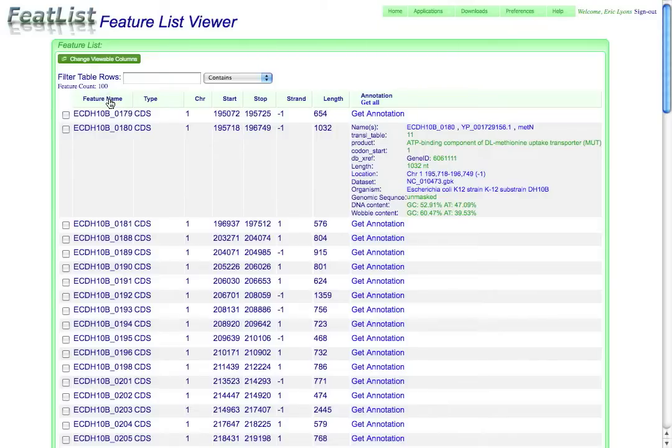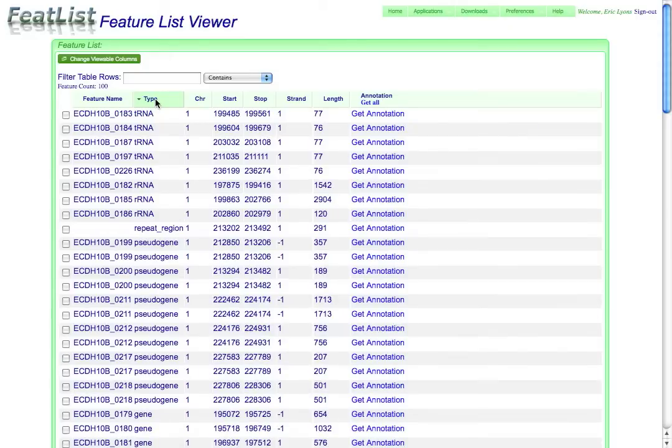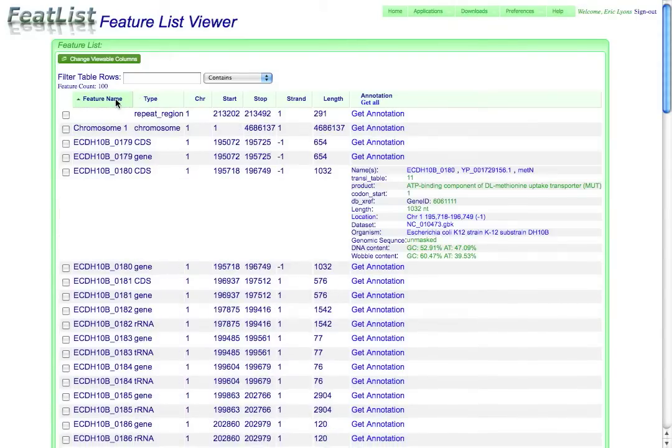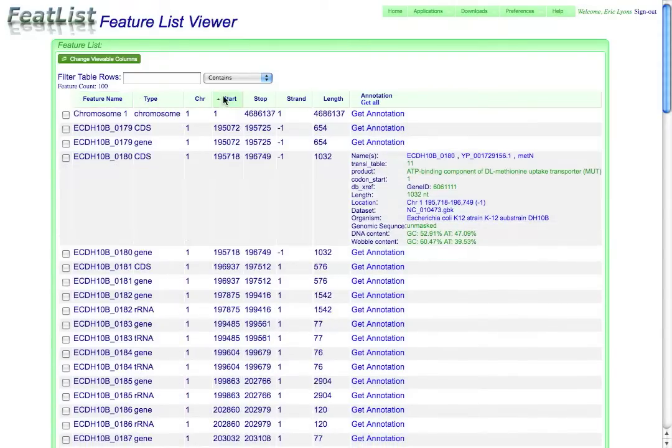And it can also let you sort these lists of features using any one of these column headers. So if I wanted to sort by type, I can just select type, and I can sort by that. I can also sort by the names or the start position within the genome.